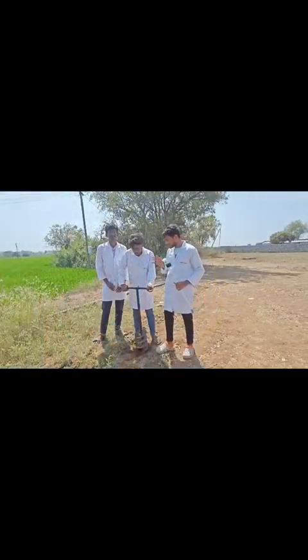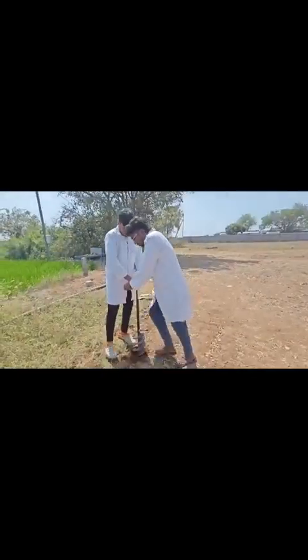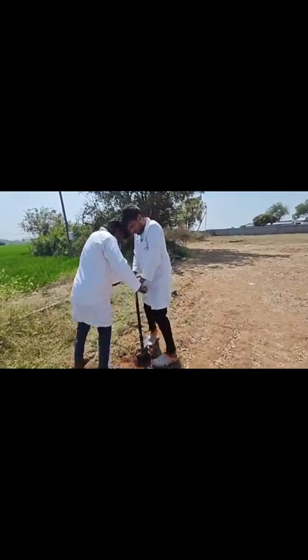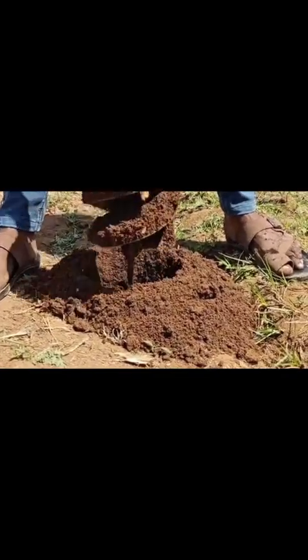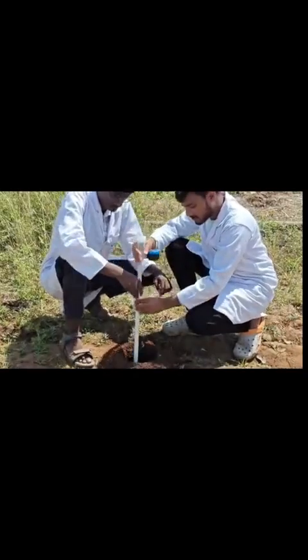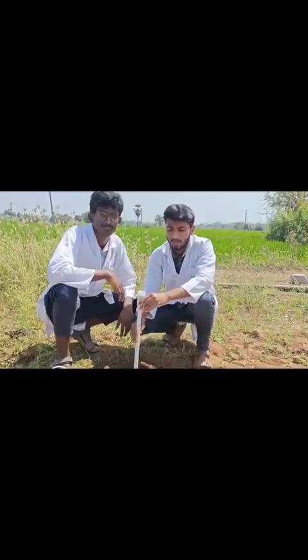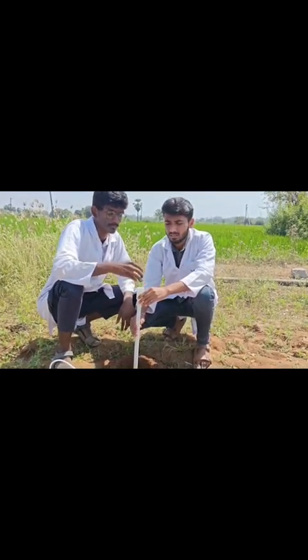First, we have to dig a hole with the help of the screw auger. Place the tensiometer in the dug hole. Now we have to open the cap of the tensiometer and fill distilled water up to a certain point.